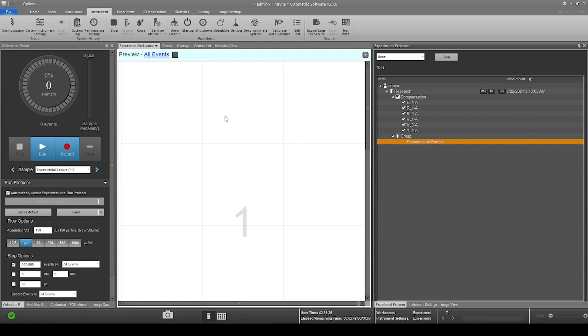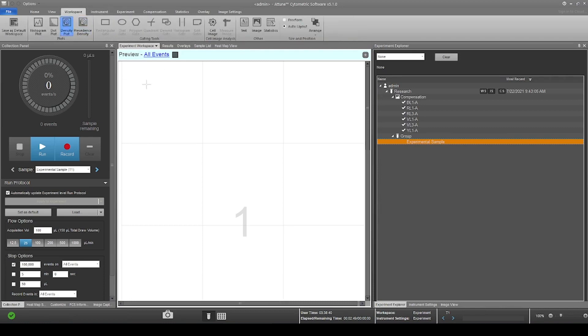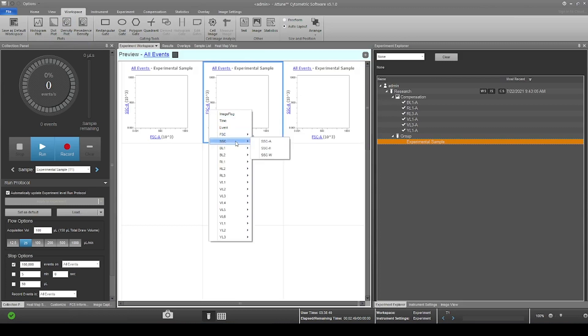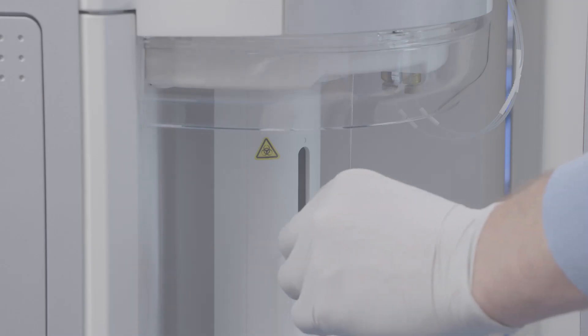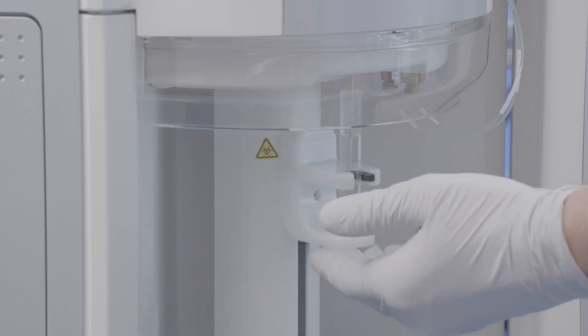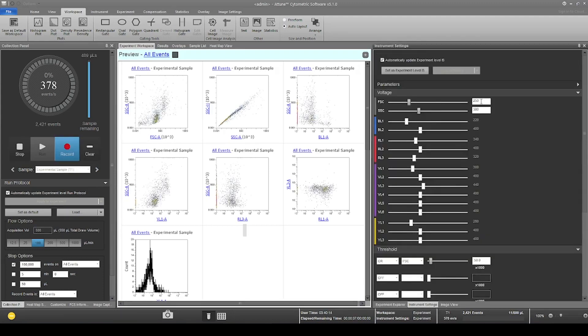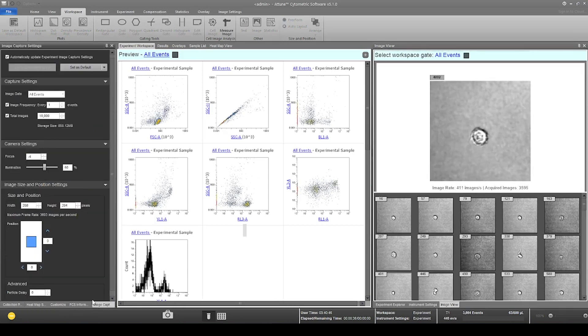We will optimize our experimental sample settings. In the experiment workspace, create plots of interest and label them in the instrument settings window. Next, load your sample into the sip tube and raise the sip stage into place. Adjust the flow rate and volume, then press run. You may also need to adjust the forward and side scatter, and if necessary, adjust the threshold settings to filter out any noise population. Select the Image View tab and the Image Capture Setting tab, and adjust the image capture settings in the Experiment Settings window.